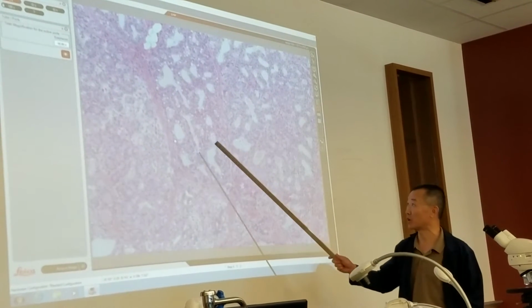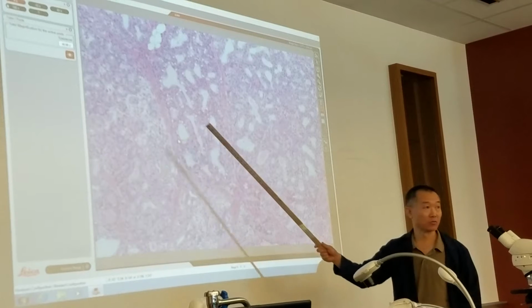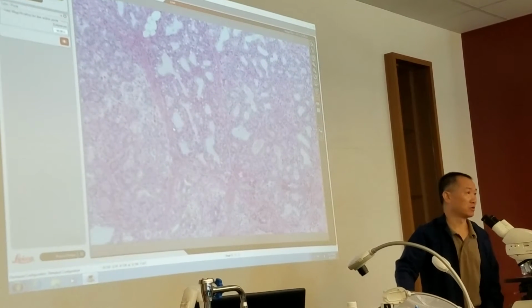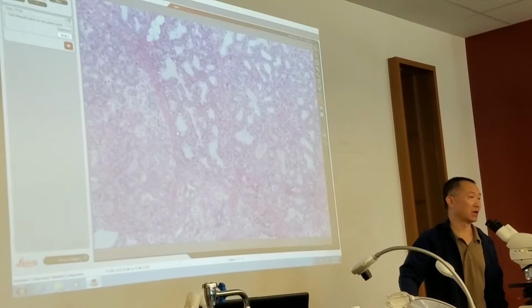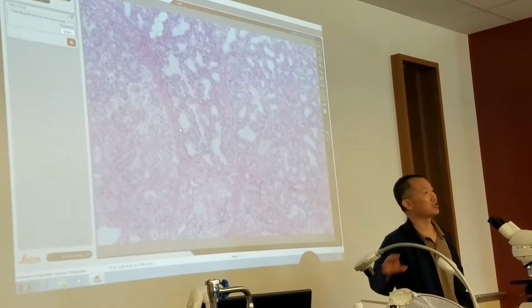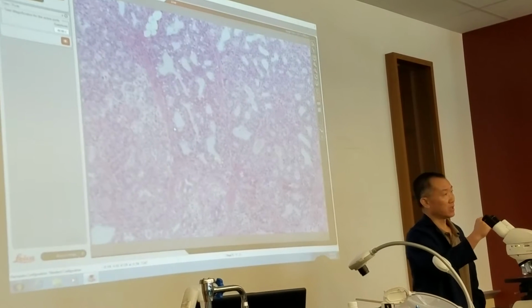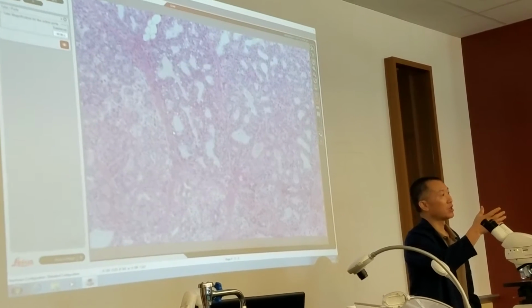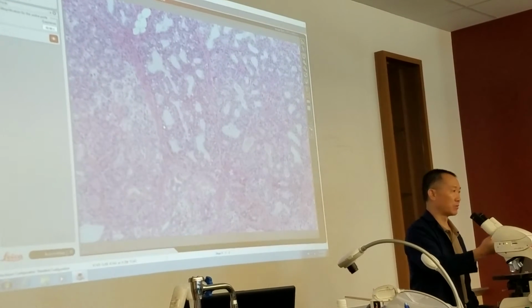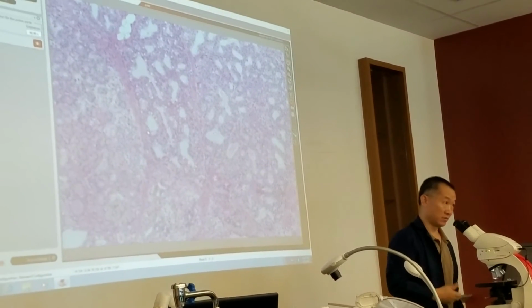You can see those white bubbles, or vacuoles, filled with synthesized materials like milk proteins. Fat mostly comes from the cells pinching themselves off. The cell membrane contains phospholipids that form the majority of the fat, which is needed by the baby to synthesize the baby's cells.